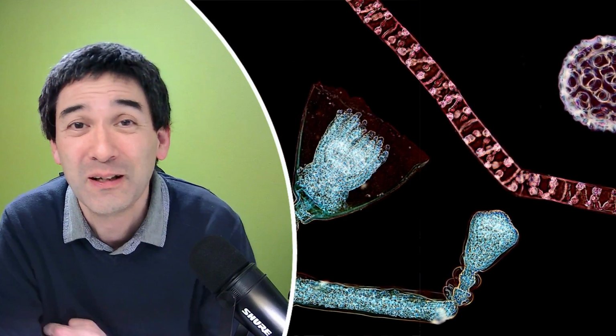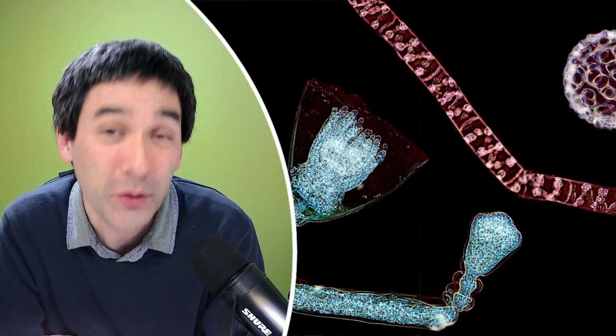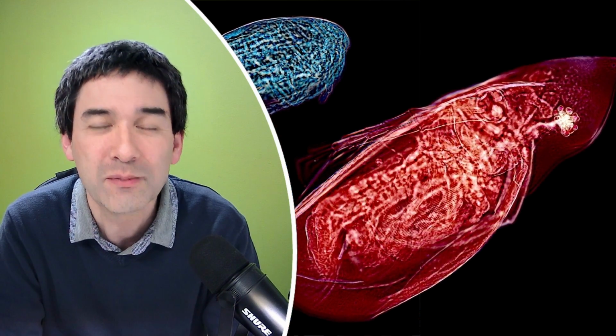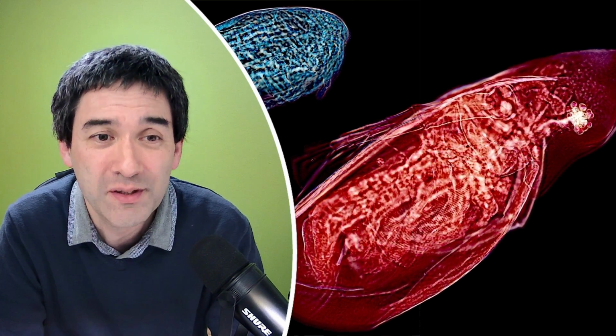Again, because similarity under the microscope does not automatically or in all cases imply that the organisms are also related. Just because two cars have the same color does not mean that they're the same brand of car, to use a very simplistic analogy here, right? So this is basically the thing here. The other tiny organisms swimming around, I can tell you these were probably also protozoans because simply of the size and the general appearance that they have.